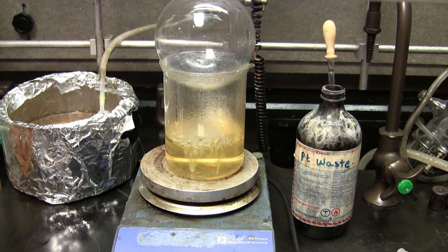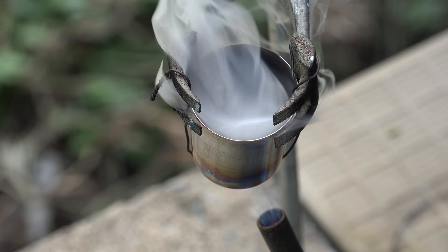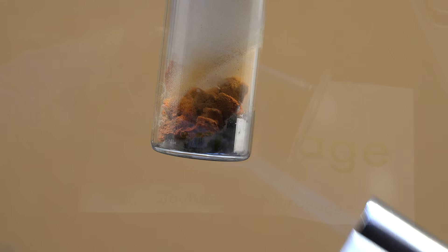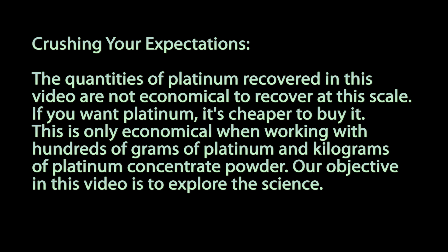Greetings fellow nerds. In a previous video, we processed liters of laboratory chemical waste from an organometallic research lab to produce a couple grams of platinum concentrate powder. In this video, we're going to try and extract that platinum. First, I need to crush your expectations. The quantities of platinum recovered in this video are not economical to recover at this scale. If you want platinum, it's cheaper to buy it. This is only economical when working with hundreds of grams of platinum and kilograms of platinum concentrate powder. Our objective in this video is to explore the science. I can't believe I still need to keep saying that after all these years.